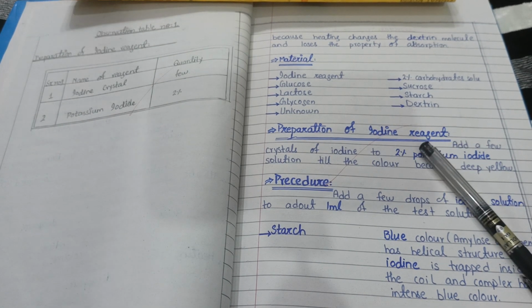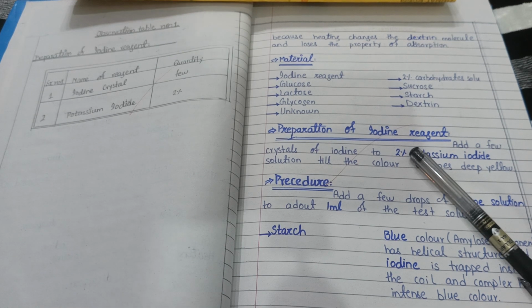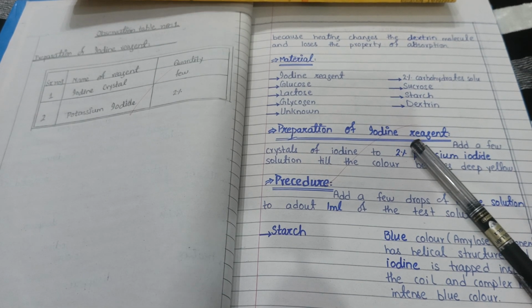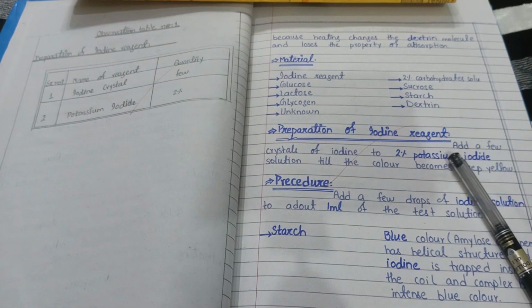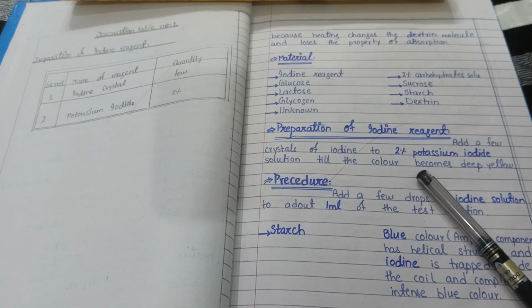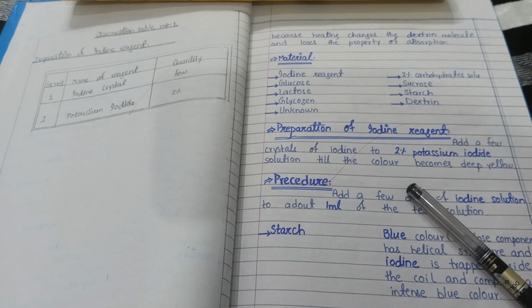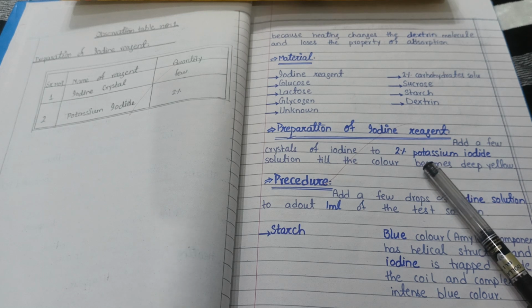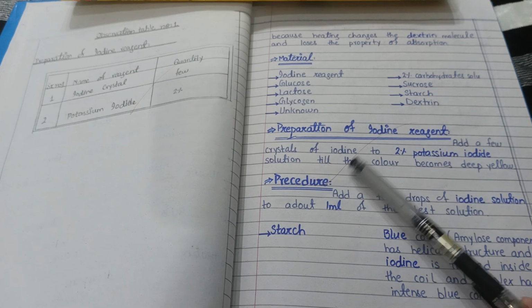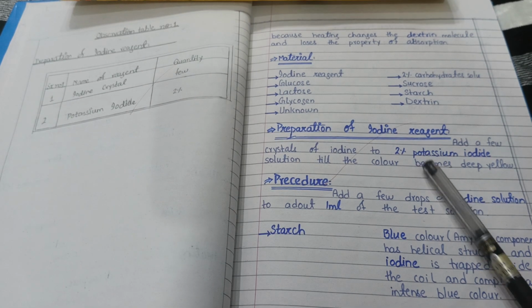So now you have to prepare the iodine reagent for this experiment. In order to prepare iodine reagent, you need 2 things. First, you need a few crystals of iodine, and second, a 2% solution of potassium iodide. You will be given potassium iodide, then you prepare a 2% solution of it. How do you prepare it? You dissolve 2 gram of potassium iodide in 100 ml. After the preparation of the potassium iodide solution, you add iodine crystals in it. In this way you prepare your iodine reagent.